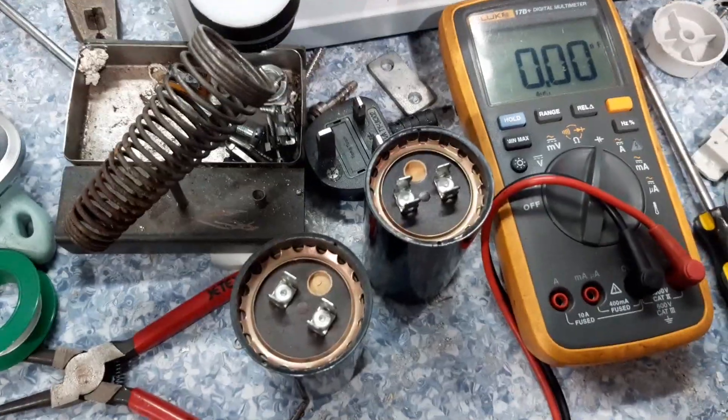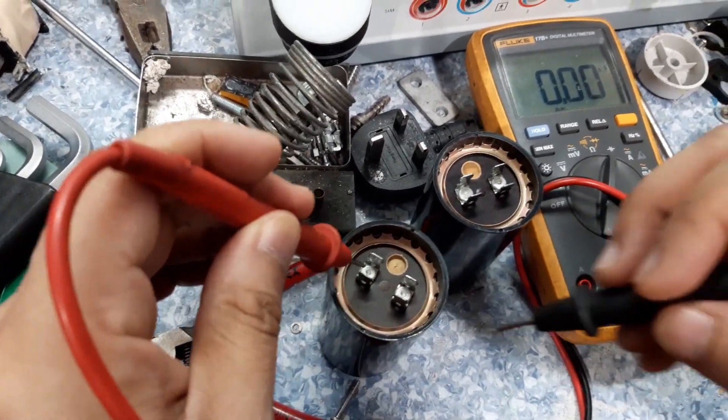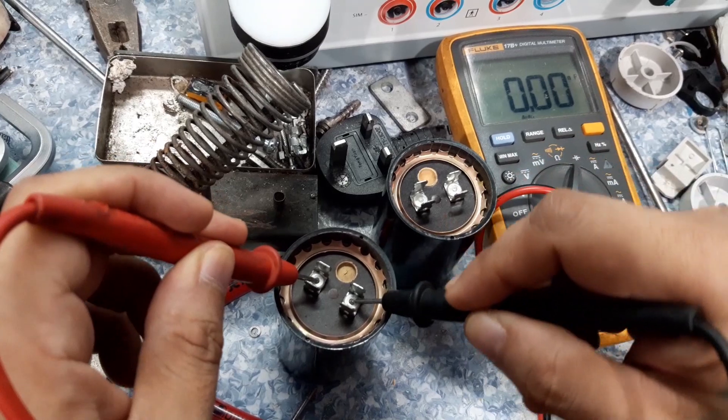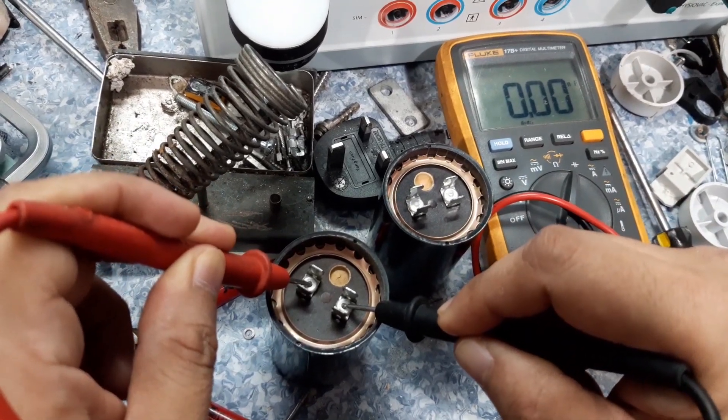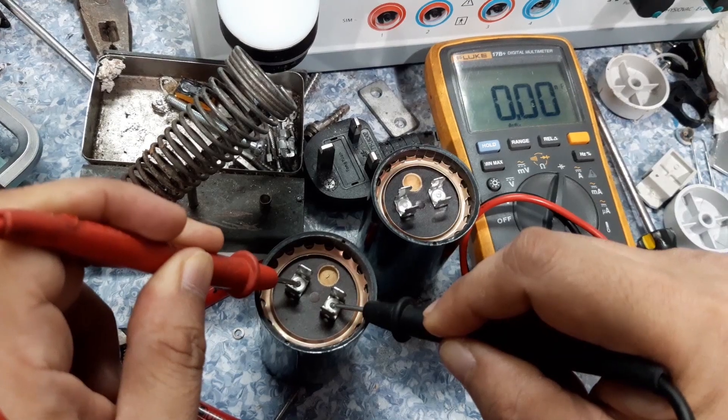Okay, first we will check the old one. Meter in capacitance mode — and we have nothing. No reading at all.